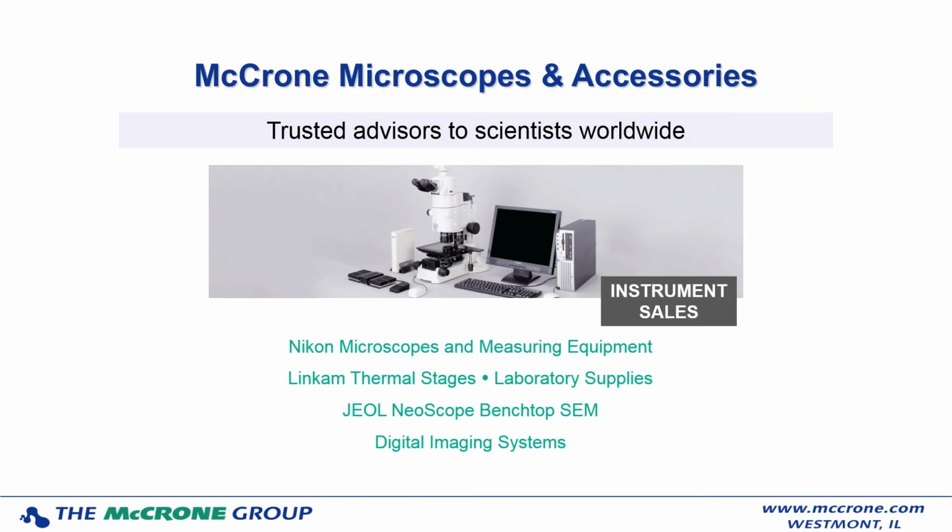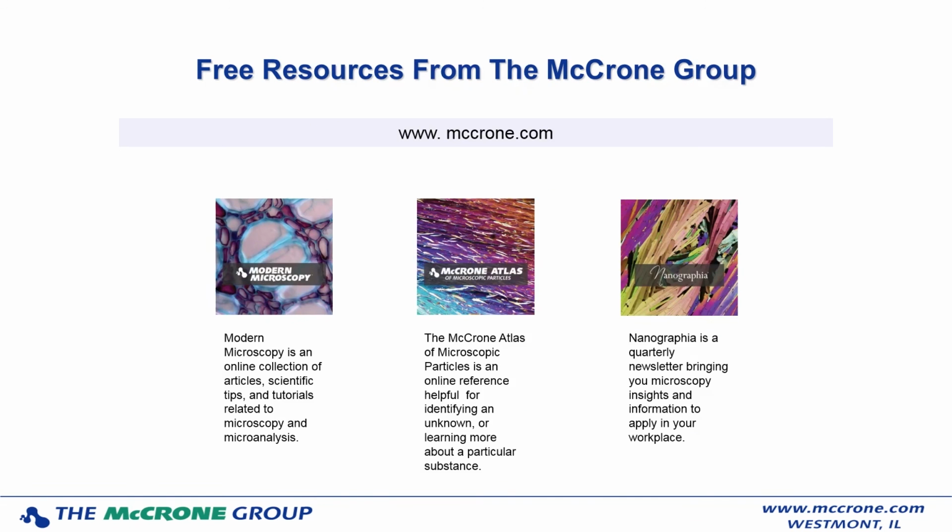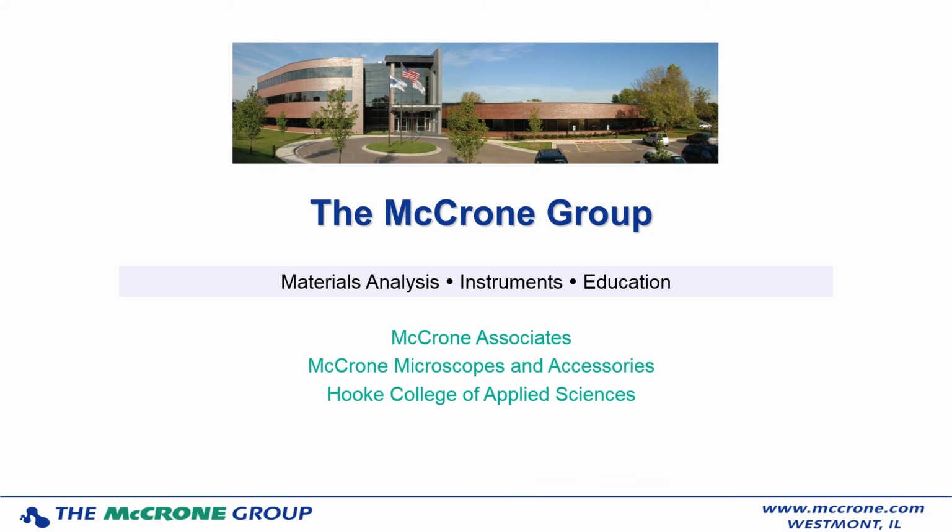What kind of configuration is needed for NDIC? There are accessories for the NDIC. You're going to need the Wollaston prisms inserted into the light path. You're also going to need the polarizing filter and the analyzing filter along with it to make the crossed polarizers that you need with NDIC. Again, you'll have to check with your manufacturer to find out what accessories you're going to have, but that would be the basic setup.